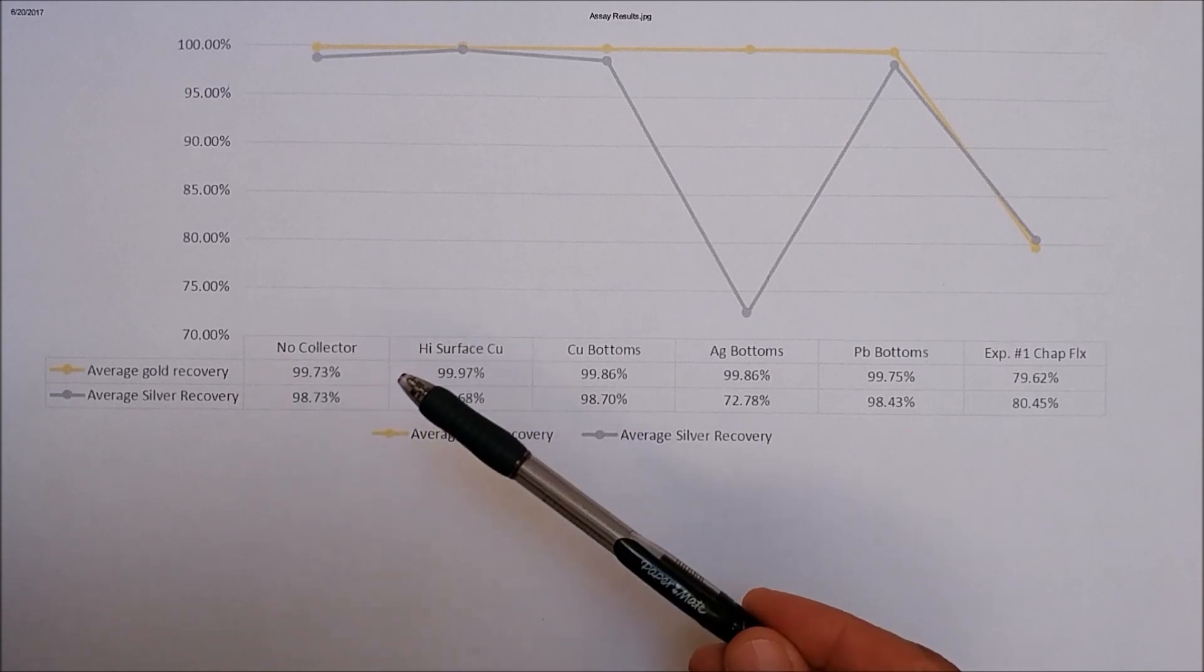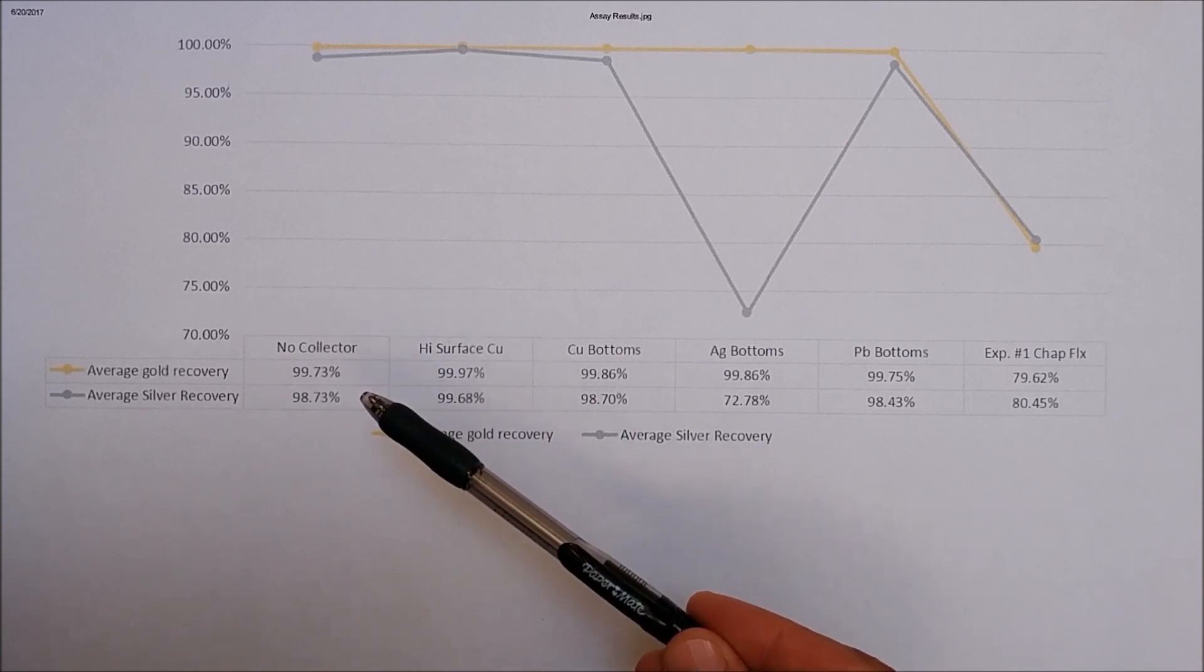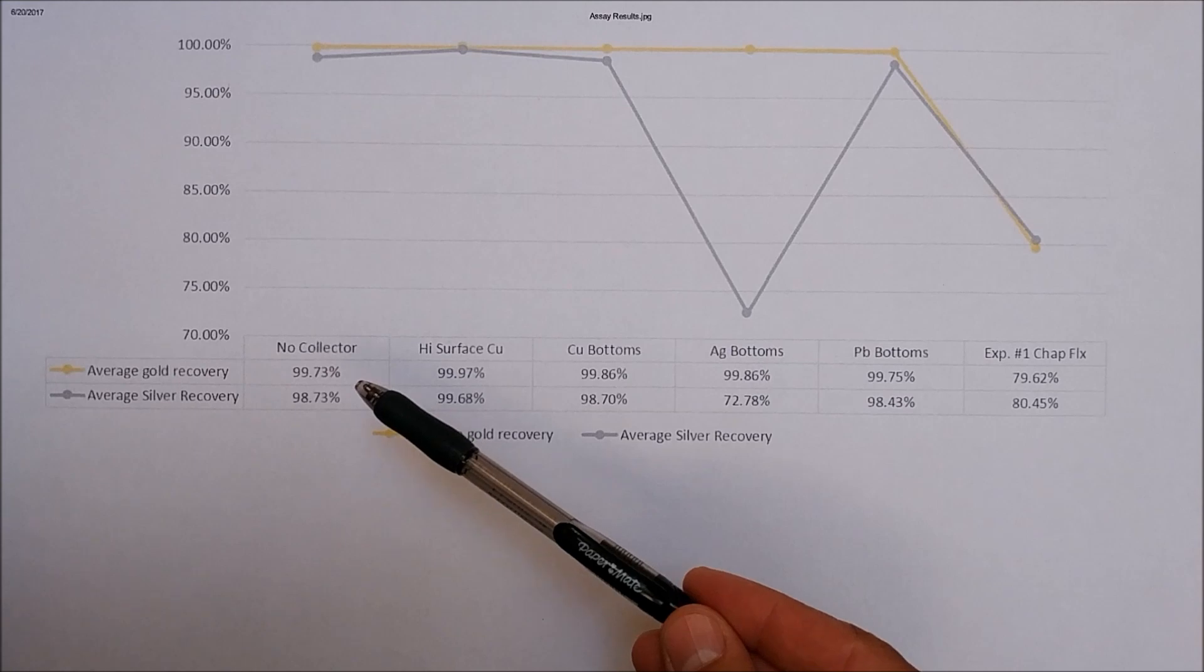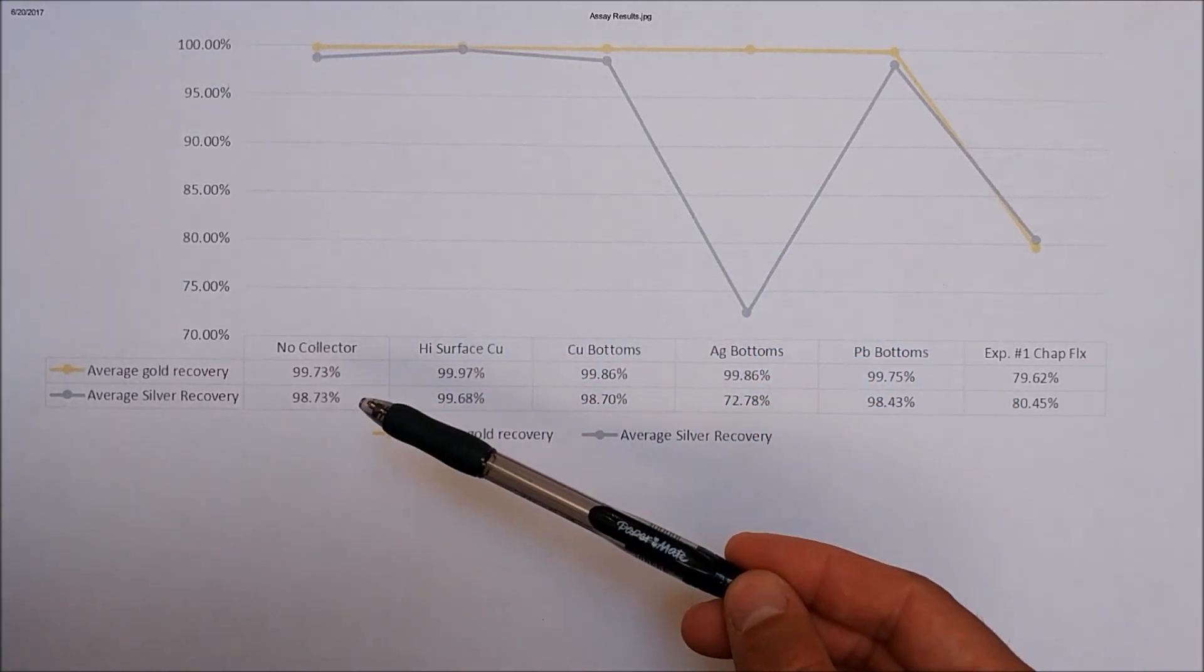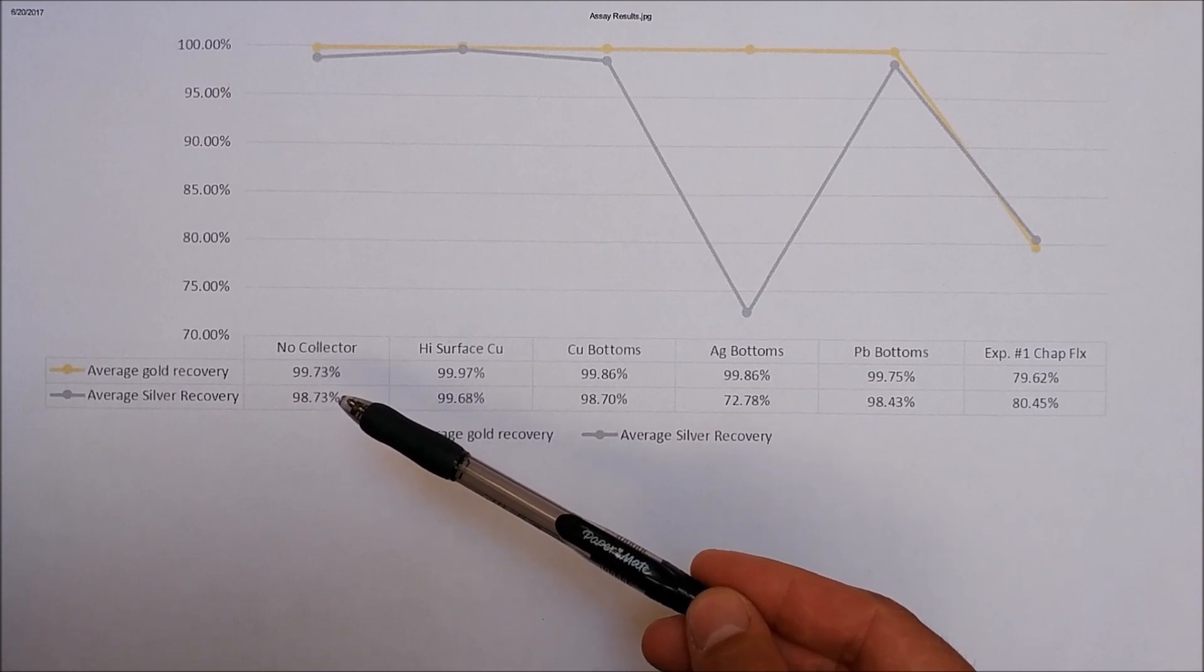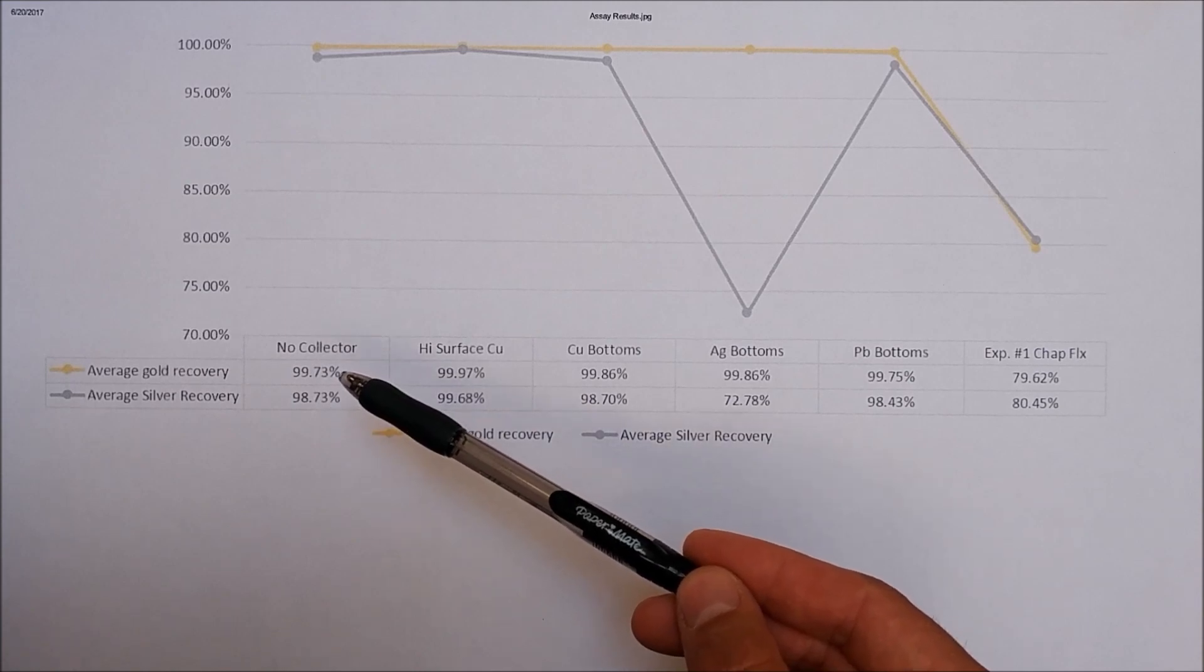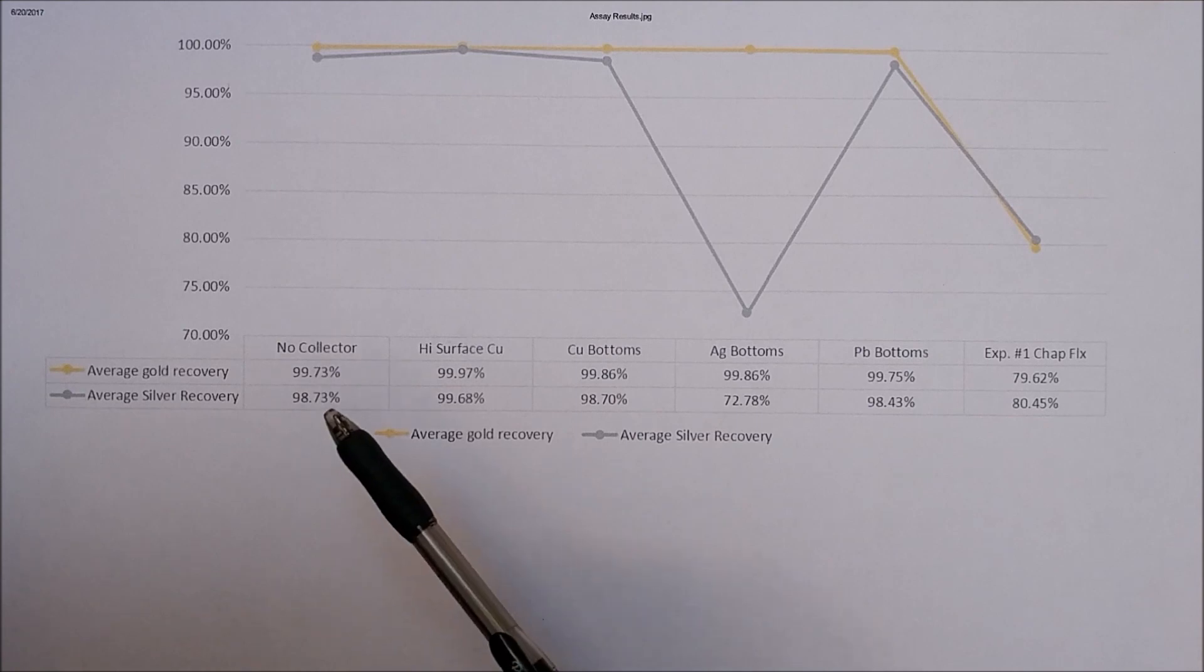So the first thing you'll notice is that even with no collector metal, that little bit that we reduced out ended up with fantastic gold recovery and equally as good silver recovery. I mean, 99% silver and 99 plus percent gold. So that went fantastic.